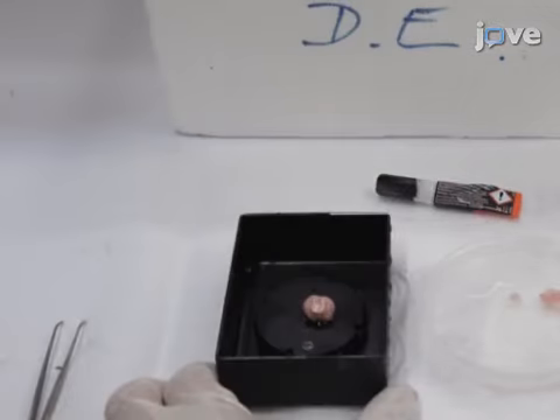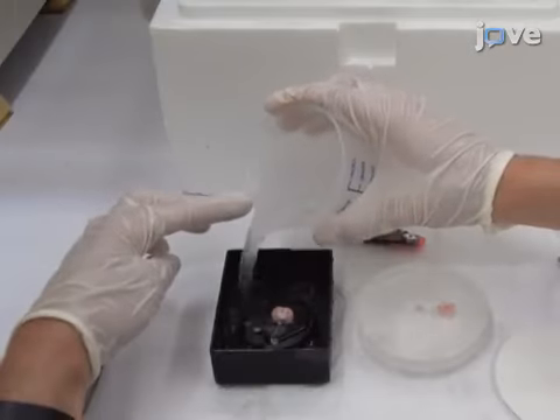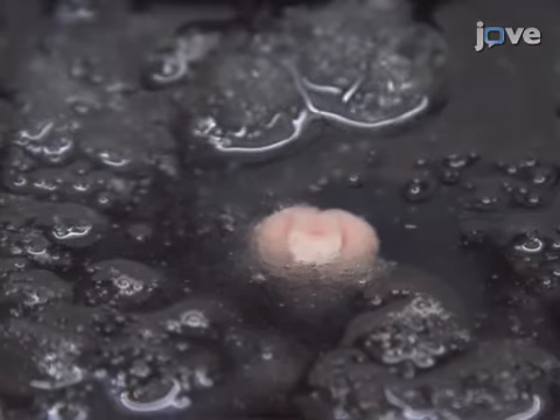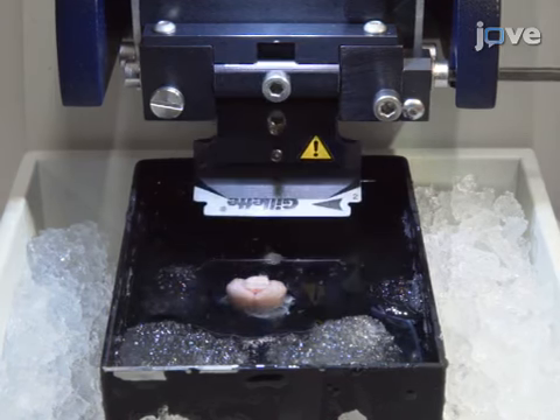Subsequently, apply a few drops of sucrose ACSF on the brain and slowly submerge the tray into the cutting chamber. Afterward, adjust the razor blade at an angle of 15 degrees with reference to the horizontal plane.